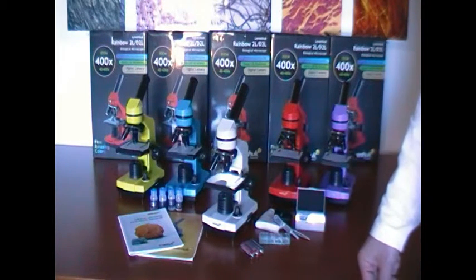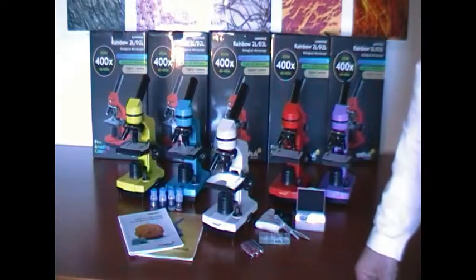The microscope is delivered with a lifetime warranty. Thank you for your attention.